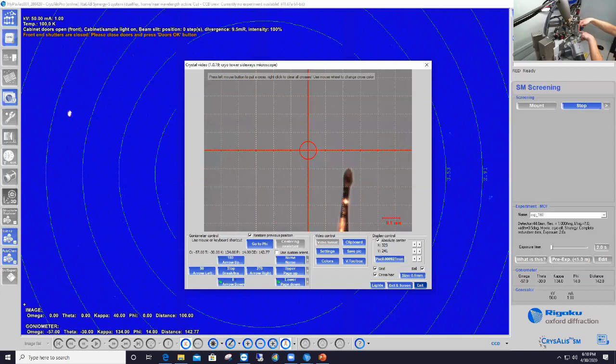So here is that straight angle. And that orientation of the pin will allow me to center the crystal in the horizontal plane as shown by my left finger right now. And so in the perpendicular direction to the camera. So the way you want to center your crystal is always in the direction perpendicular to the direction of the camera. So to center my crystal, I will use this tool.